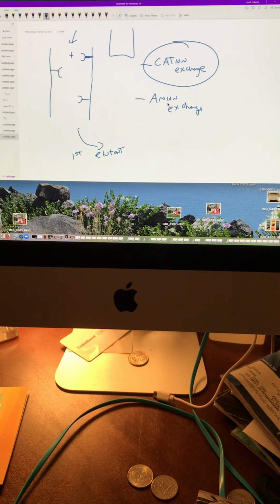So the goal is this. I've got a solution, and they'll ask when would you want to use cation and anion exchange. You want to use it when you have molecules that are separated in pretty big charge. So let's say I have 3 molecules in here, and I know I have 3 molecules, but I want to separate them. Cation exchange is great when, if you have 2 positives, it's kind of useless. But if you have a positive, 0, and a negative, it's good.